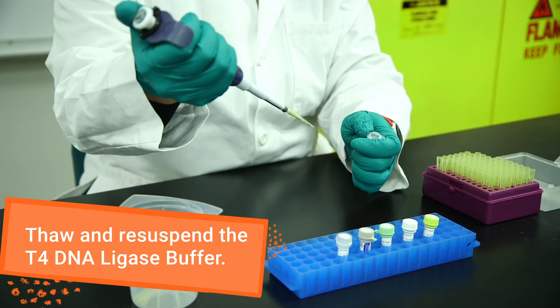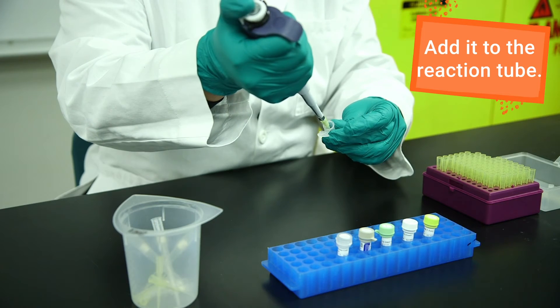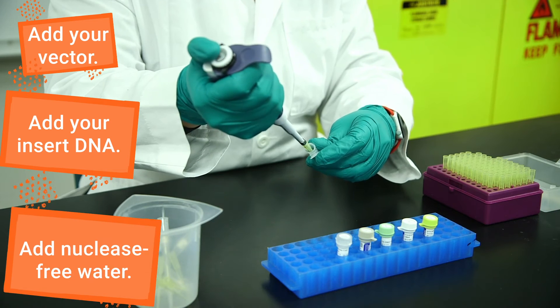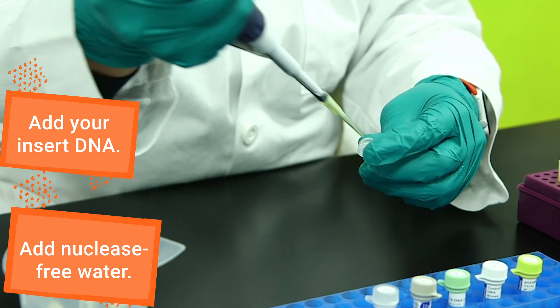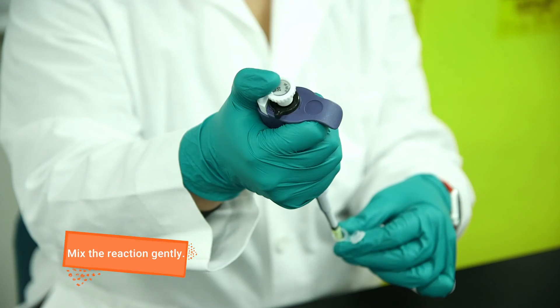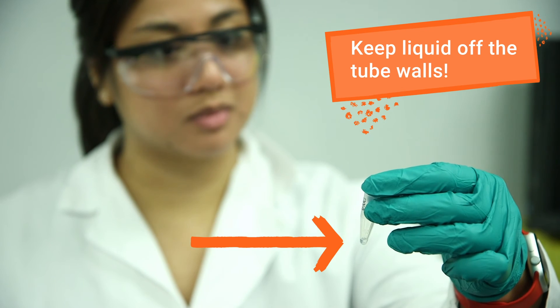Thaw and re-suspend your T4 DNA ligase buffer and add it to the reaction tube. Add your vector and insert DNA, followed by the nuclease-free water. Finally, add the T4 DNA ligase. Mix the reaction gently and make sure no liquid is sticking to the side of the tube.